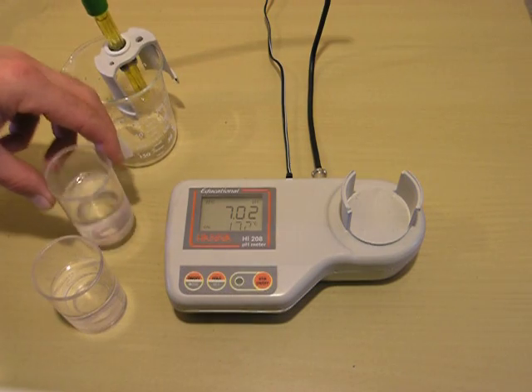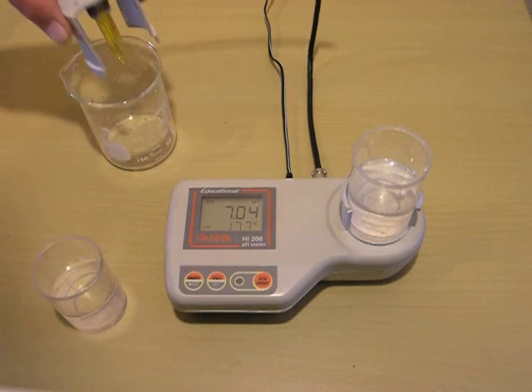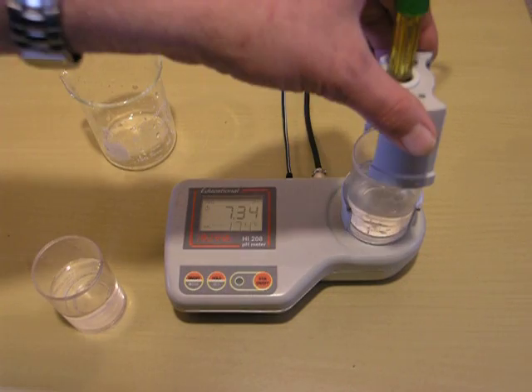Put a clean beaker with pH buffer 7.01 and a stir bar on the machine. Rinse our probe real quick, then replace the cap.